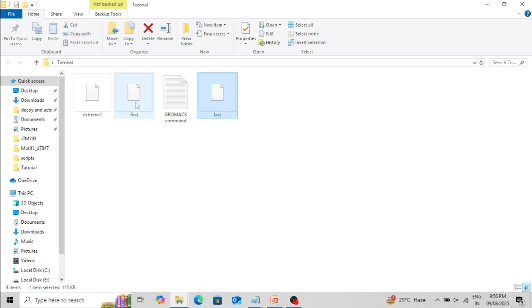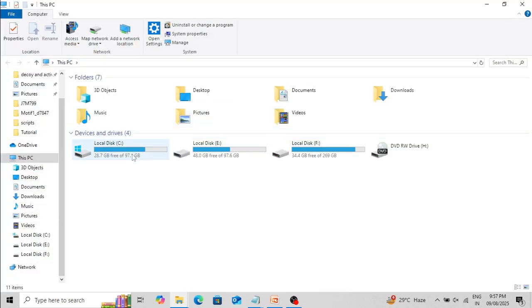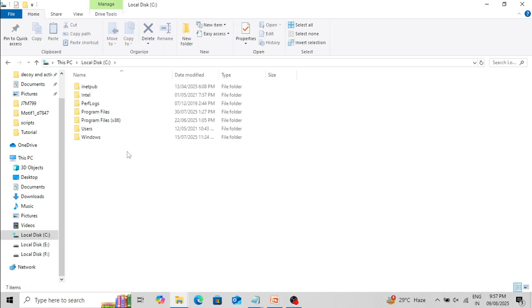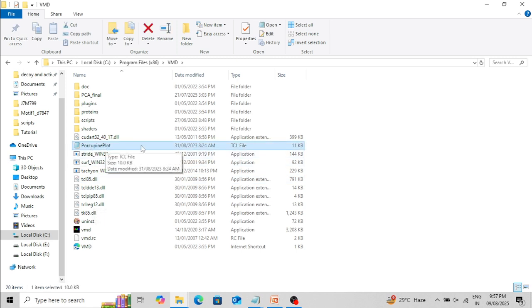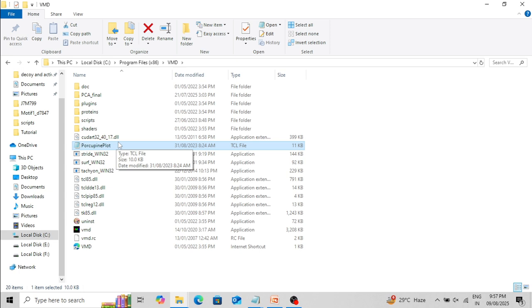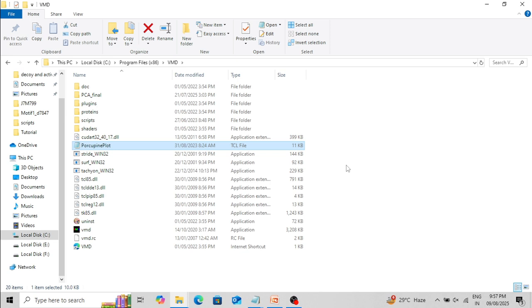Now we have the two extreme frames, and we need one more file — a TCL script for generation of the porcupine plot, because VMD software needs this script. The script porcupineplot.tcl is located in the VMD installation folder under Program Files. Without this script the plot cannot be generated; it contains instructions on how to generate the porcupine plot. You can download this script from the description box of this tutorial.